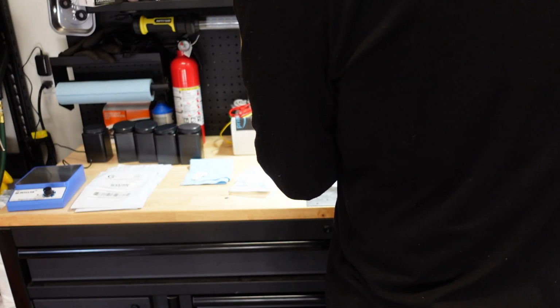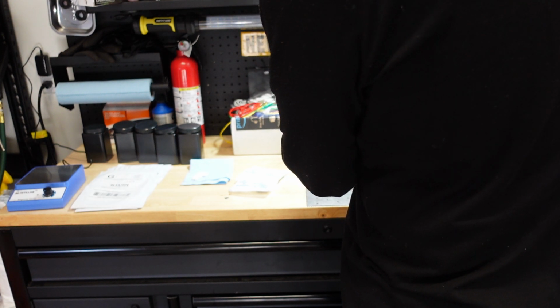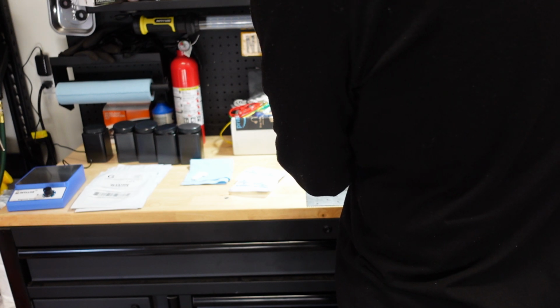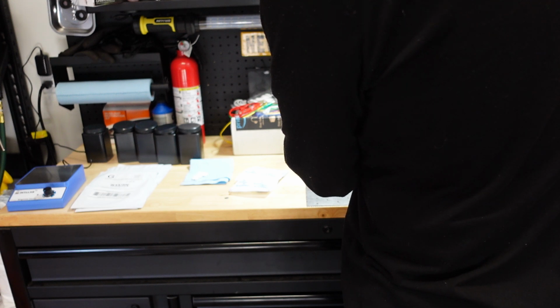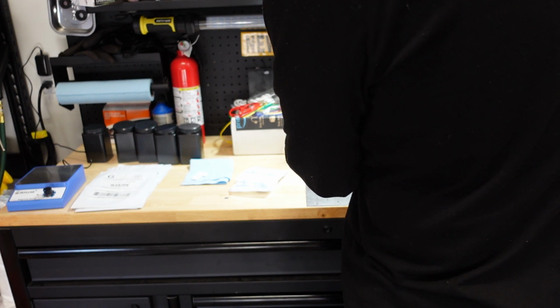220 mLs. So I'm gonna get it close, just pouring it in here like this. Then I'm gonna take a transfer pipette and refine this. Let's get a little closer. Getting closer. Okay, that's a little close.